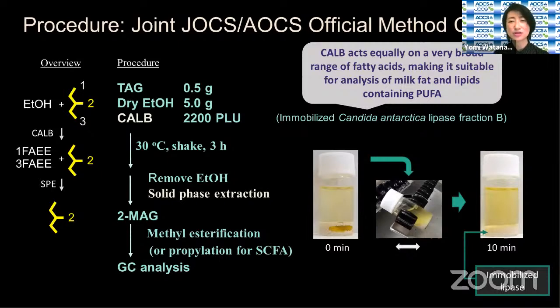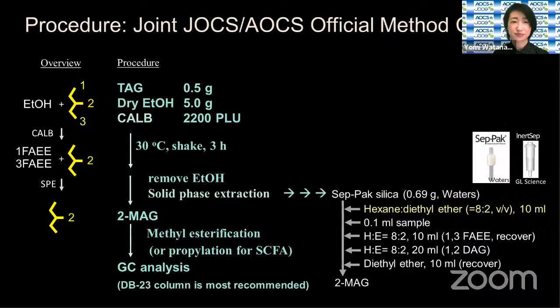After 3 hours of shaking, the immobilized lipase is removed and the reaction mixture can be stored in the freezer or immediately brought to a following SPE step. The solid phase extraction is carried out with commercial pre-packed silica gel column.